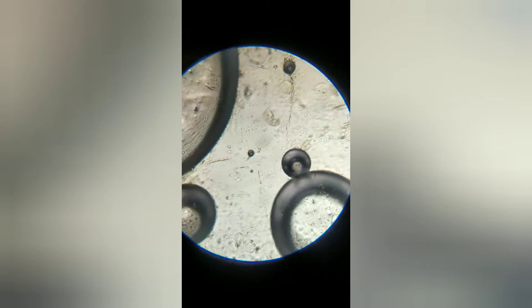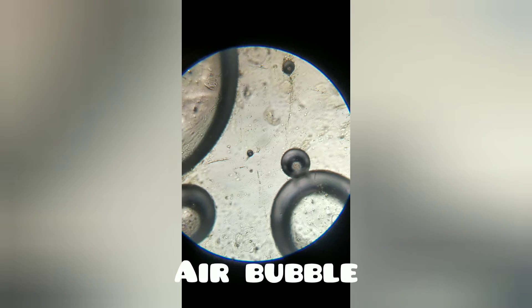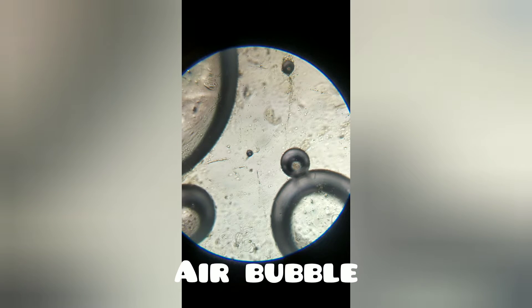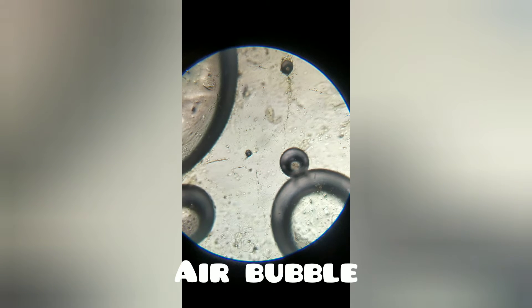Okay, we're done. So let's take it to the microscope. As you can see, those large circular objects present on the screen are air bubbles.